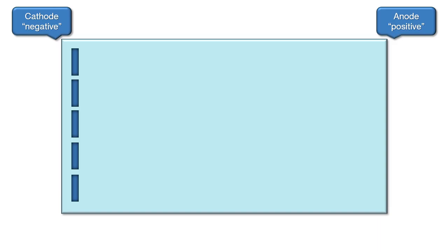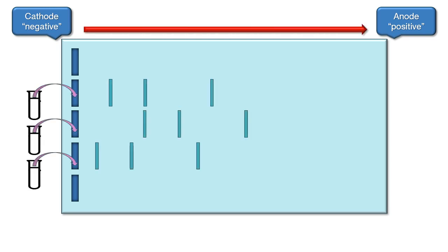So after all of this, how do we check our cloned DNA? One way would be to use gel electrophoresis to separate out the DNA pieces to verify that it's the right size. In this procedure, DNA is loaded into wells in a gel, and an electrical current is used to separate the DNA. Since DNA is negatively charged due to all of the phosphate groups in the backbone, it will travel towards the positive electrode, termed the anode, with the smaller pieces traveling further through the gel due to less resistance.